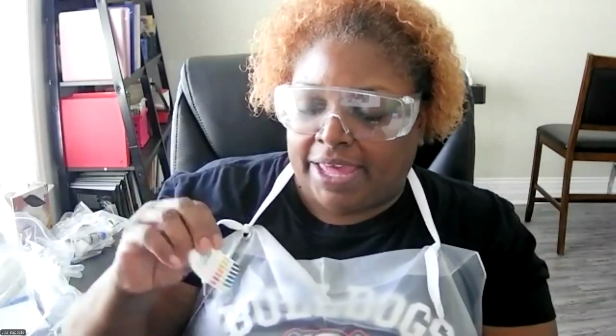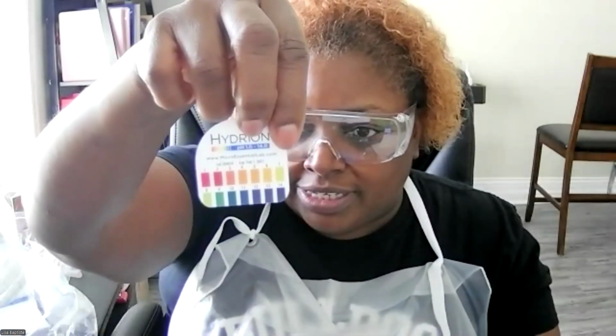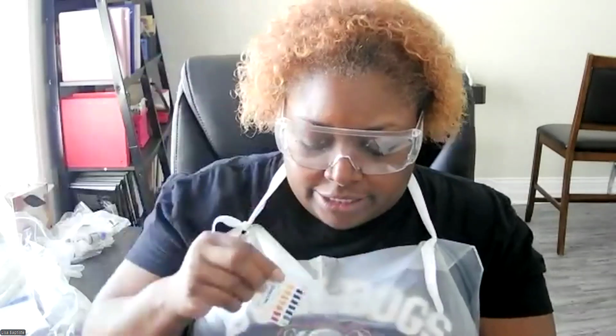They're going to change color based on the pH, and then you match it up with this scale as closely as possible. It's similar to what we did when you were working with the cabbage juice, except now pH paper is another way of detecting pH. So there's the pH meter, pH paper, and then pH indicators. The indicators are what you use with the cabbage juice; pH paper is what you use this week.